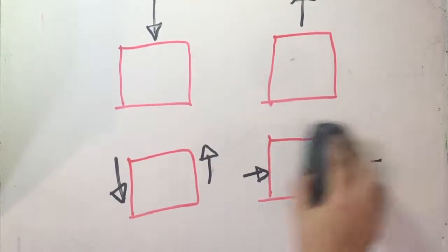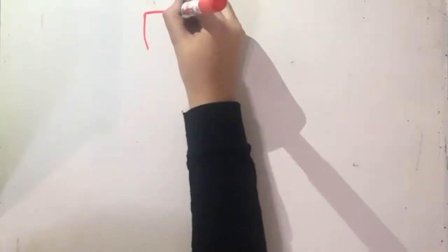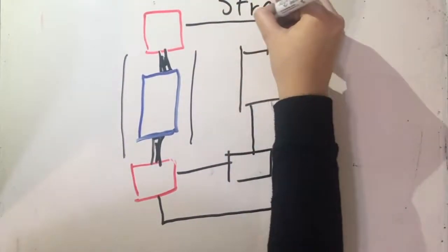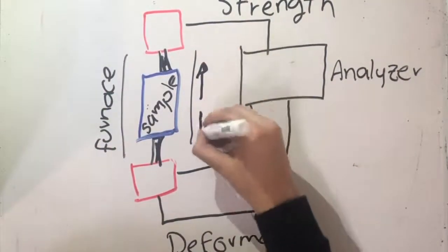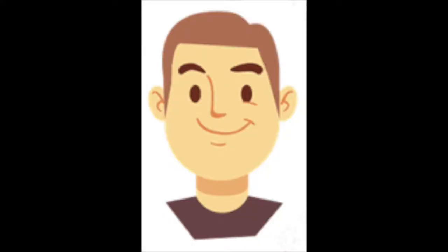In the compressive test, you can determine the force required to deform your material. Meanwhile, in the extension test, you can get the force required to break your sample. On the other hand, the shear test measures the response of the sample when a force is applied to it. This test allows you to get the viscosity values. Finally, in the flexure test, a tip presses the analyte and the equipment measures the force required. The world of characterization is amazing. I want to know more.